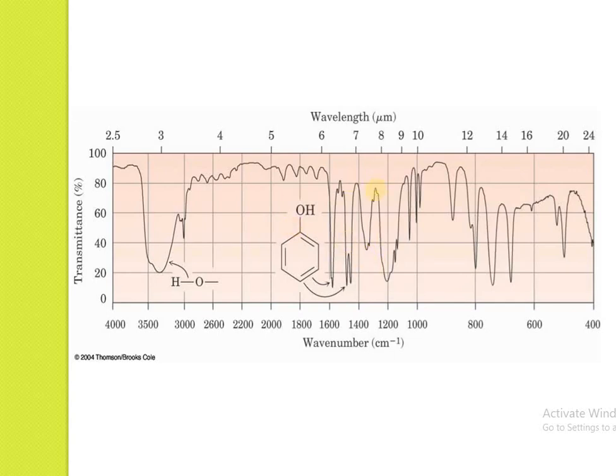So this is an aromatic compound again. In this aromatic compound, that is phenol, there is again the aromatic ring. Due to this there are two peaks around 1400 to 1600, which are due to the aromatic ring stretchings, and then this is the OH, a strong and broad peak due to OH. This also we have already done, around 3300.